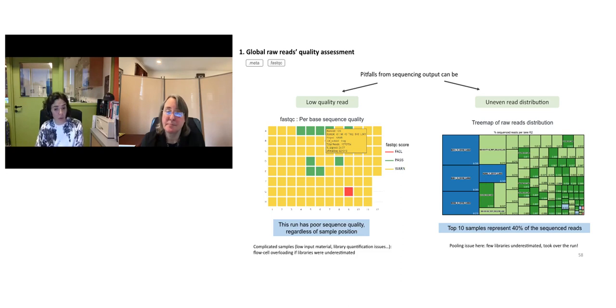Either it was a wrong series of samples, which could happen when you have complicated samples in some projects where everything is technical and complicated. You could have such a situation, and in that case, you have bad samples from the beginning, but you don't have any other possibility to try to get some information on the TCR and BCR.